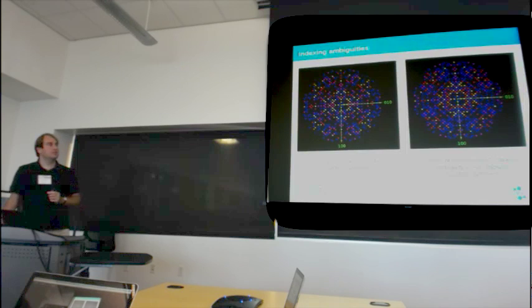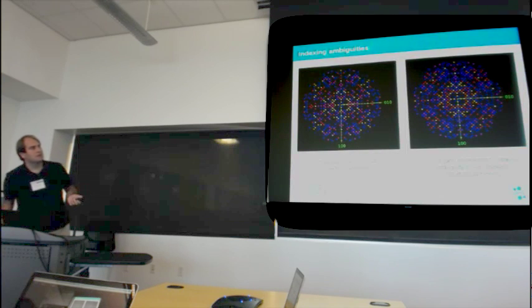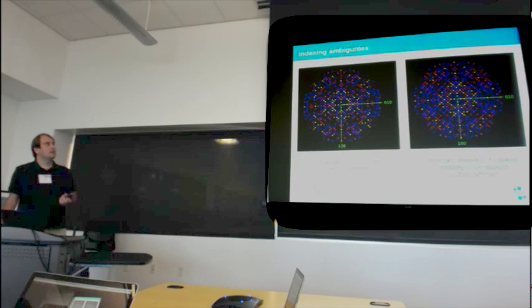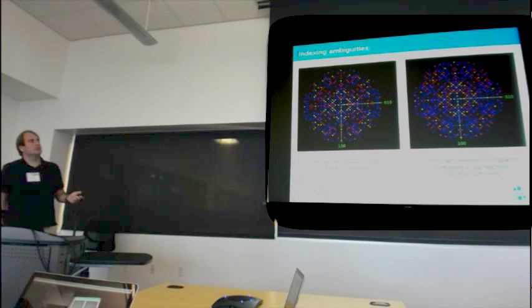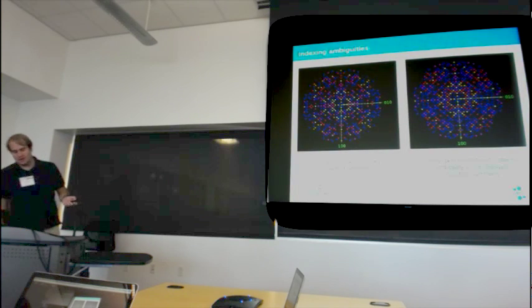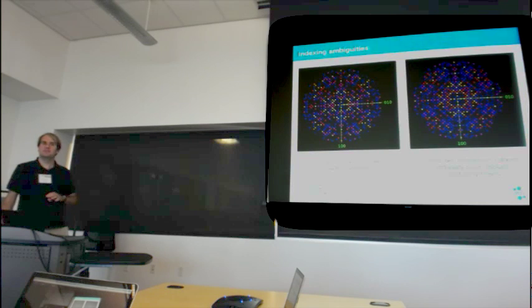Here's what will happen if you don't deal with this. On the left here is a zone axis. This is actually made with RenderHKL. If you squint at this, you'll see it has a twofold symmetry in this projection. If the indexing ambiguity is not resolved, what you'll see is this. This, if you squint again, has a fourfold symmetry. That fourfold symmetry is artificial.